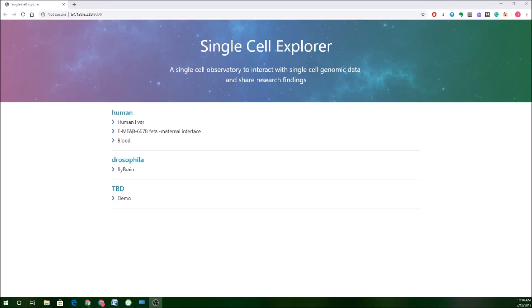Hi, everyone. Welcome to the demonstration of the Single-Cell Explorer, a new open-source tool developed by the Computational Biology Group at Boehringer Ingelheim to provide scientists with a user-friendly and collaborative environment to analyze single-cell RNA-seq data. For much more detail about the technical aspects of the tool, please be sure to check out the recent paper by D. Fang.